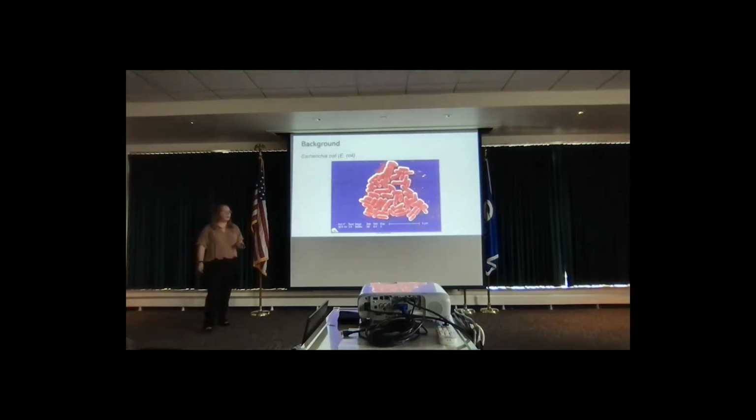So, for those of you that don't know, Escherichia coli, otherwise known as E. coli, is a gram-negative bacteria that's present in the digestive tract of humans and many warm-blooded animals. It's also present within the waters of the Great Lakes and surrounding inland lakes and rivers. We monitor it because if it's in a high concentration, it could make somebody sick if they were to ingest it. It's also an indicator that there could be other pathogens in the water.